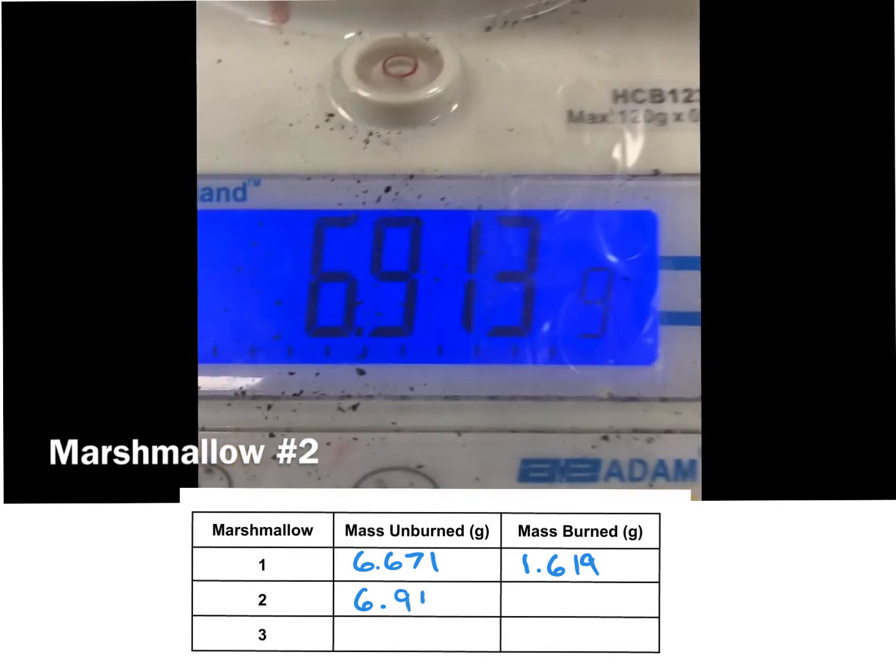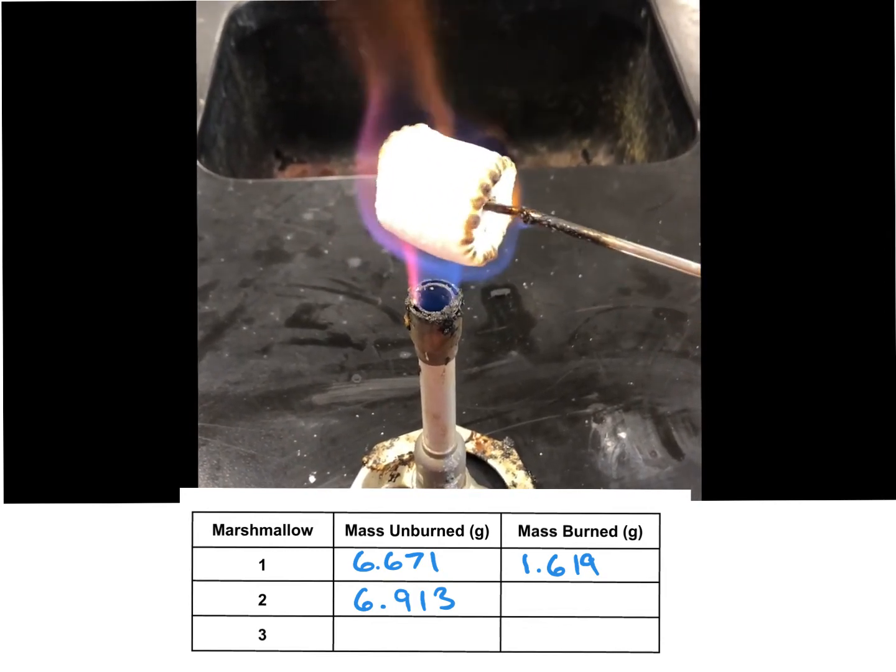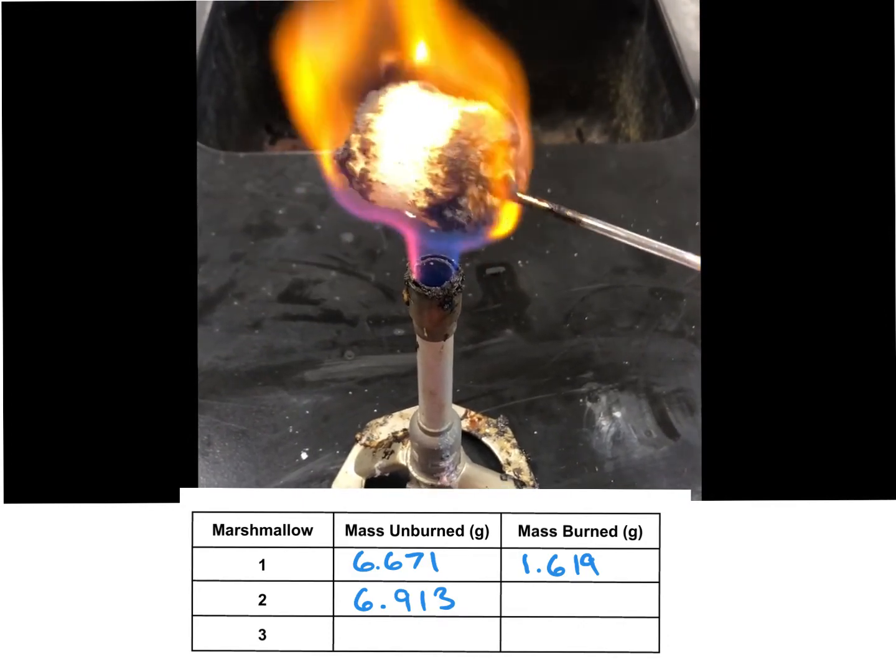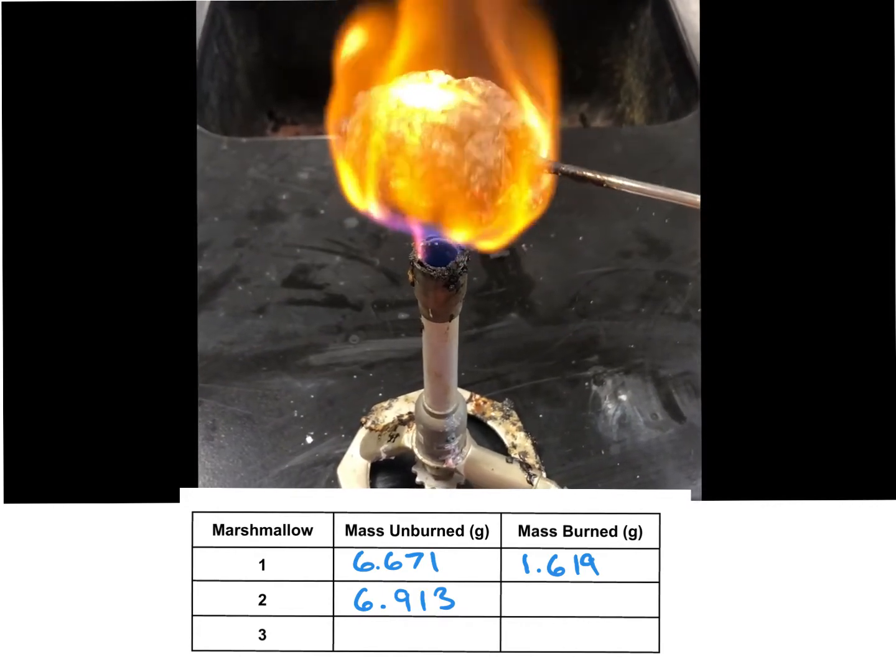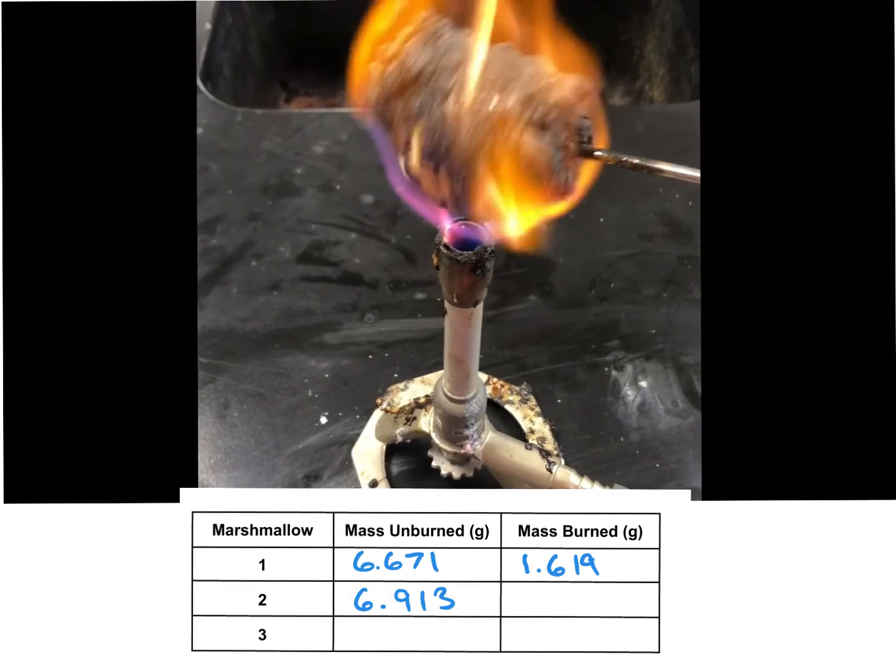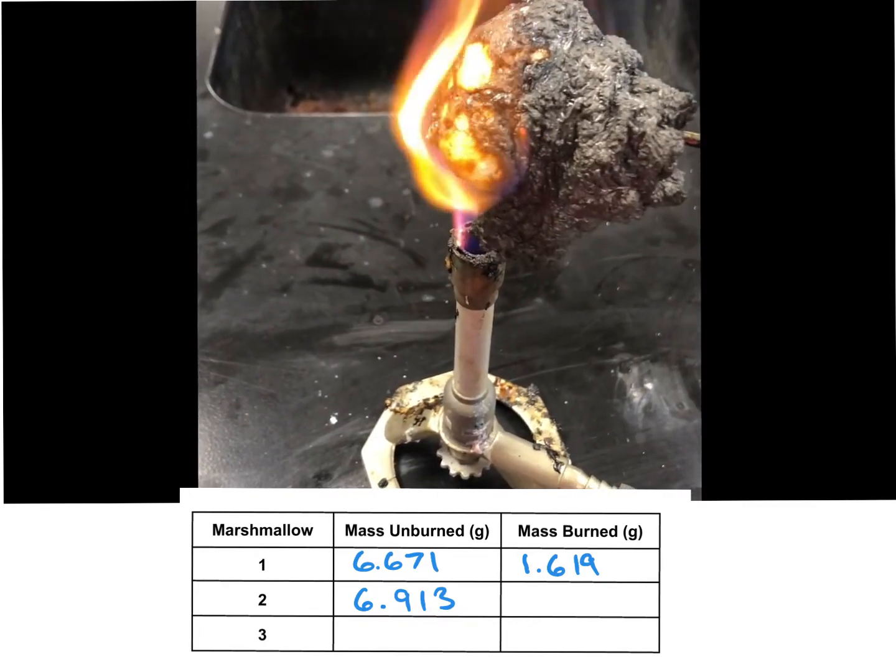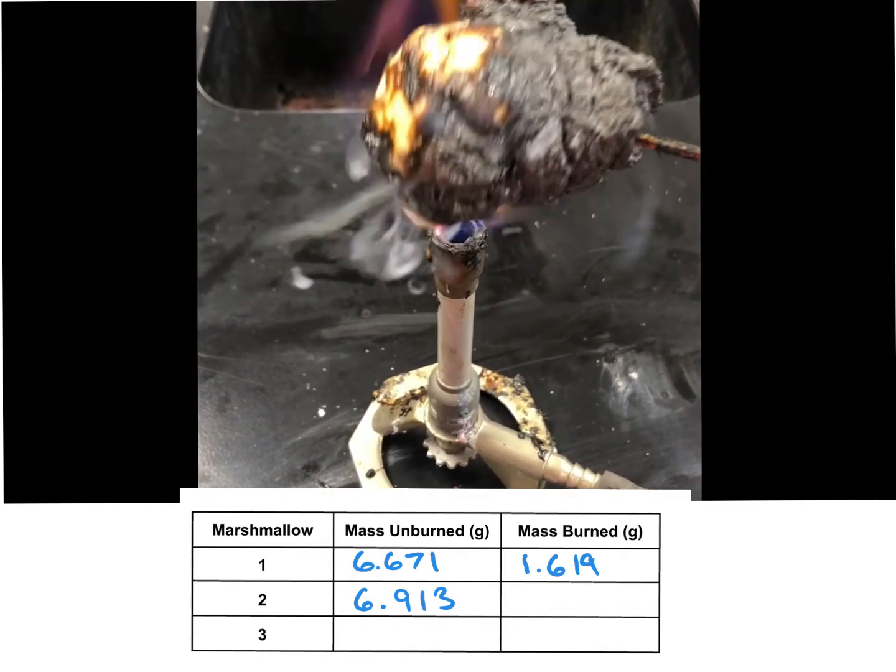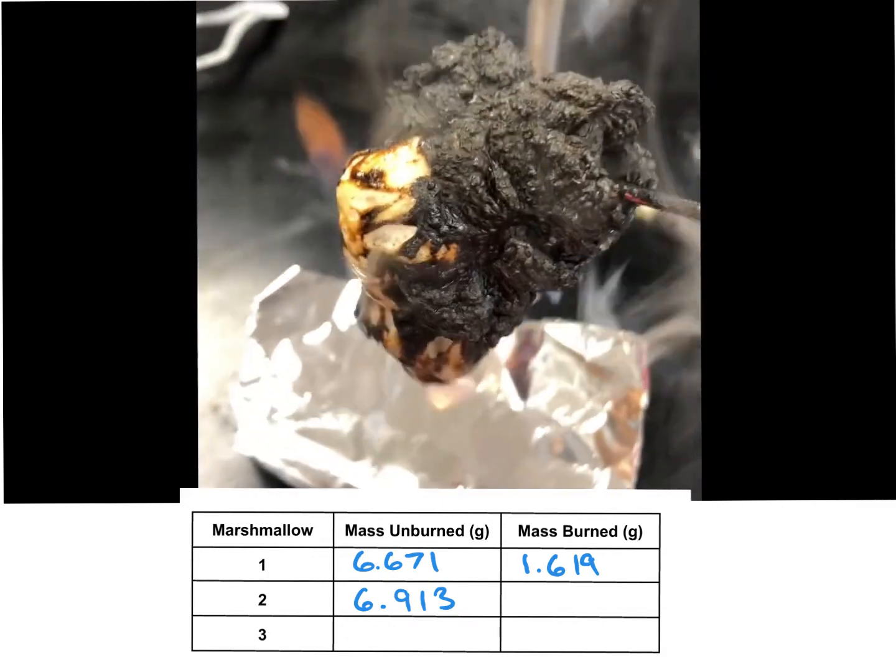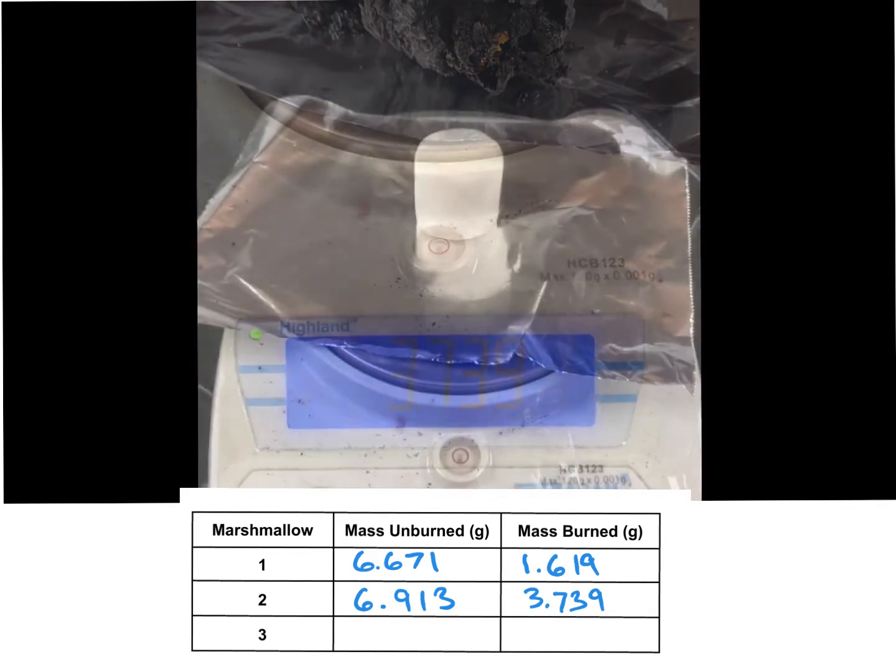It's 6.913. We're rolling right along. Cooked the marshmallows. So this is one of the best labs to do in school because we sat there. We could roast some marshmallows and eat them later on. But you just get this video version. I'm sorry. The key to a really crispy husk of carbon is the rotation. Got to burn off all the H and all the O. The mass burnt for this one is 3.739 grams.